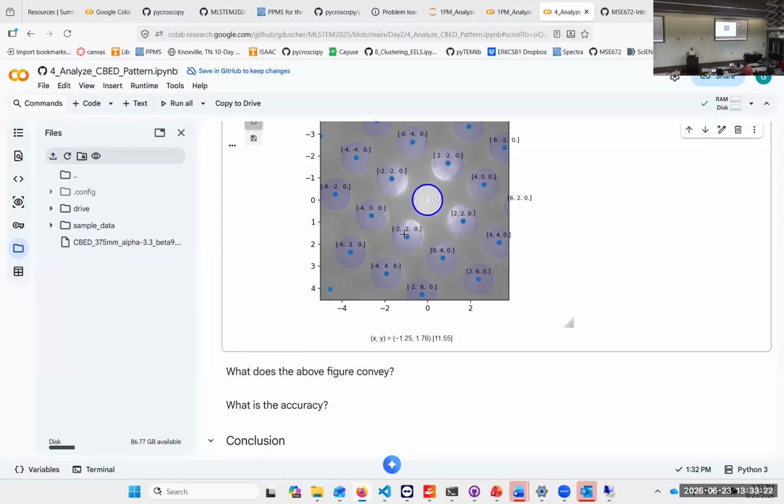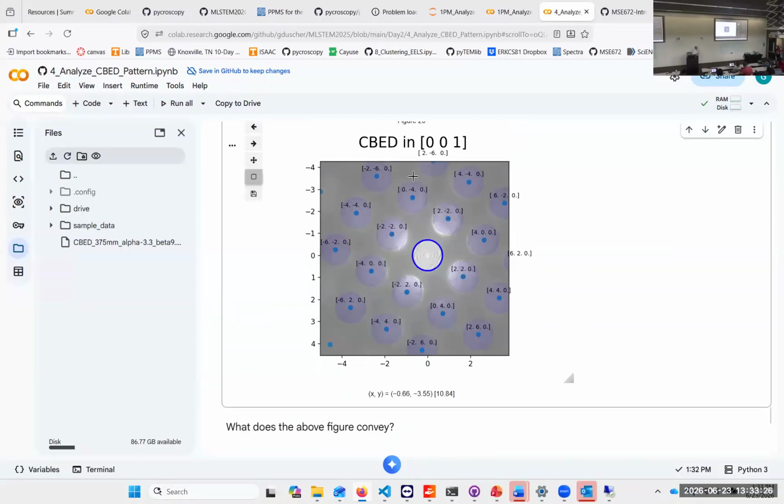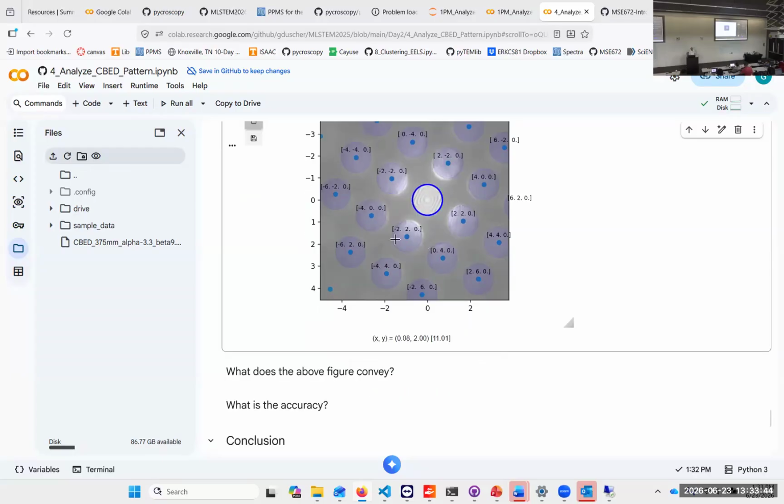What we have more than that, we also have determined the exact convergence angle, because the disks, as we saw, are directly our measure for the convergence angle. And we did that now in 1/nanometer in the same orientation as we have our diffraction pattern.